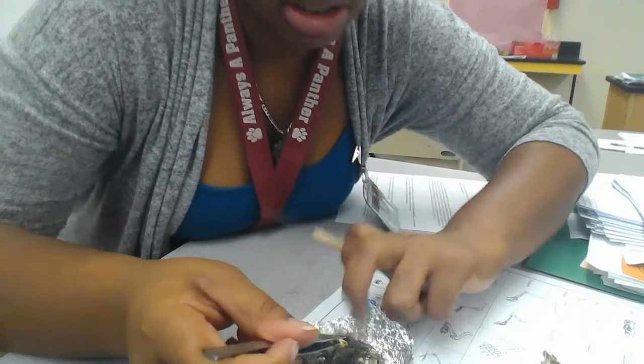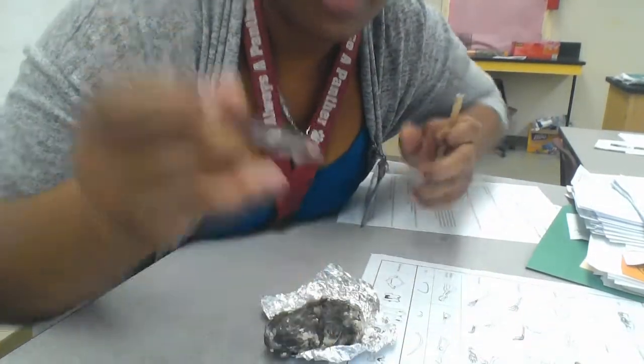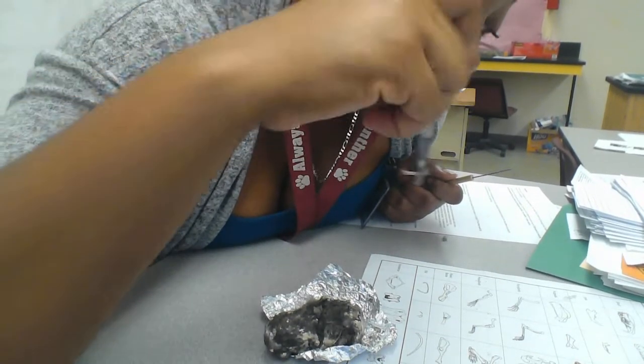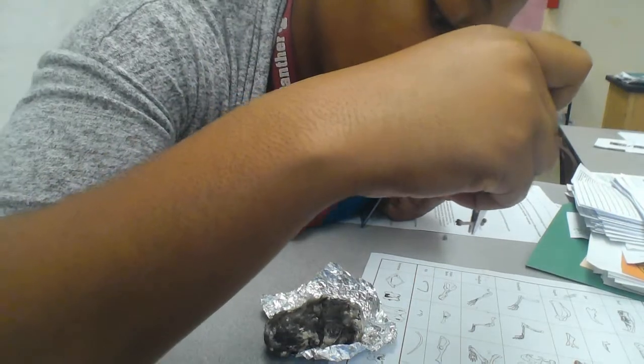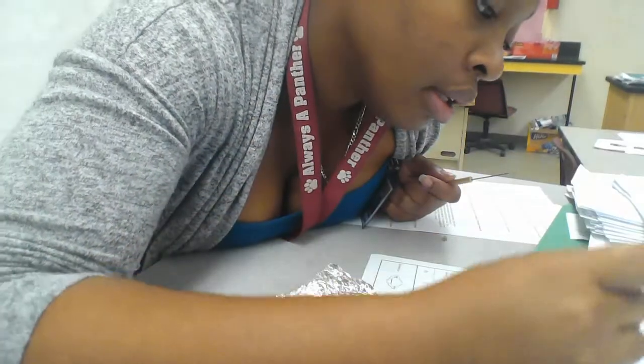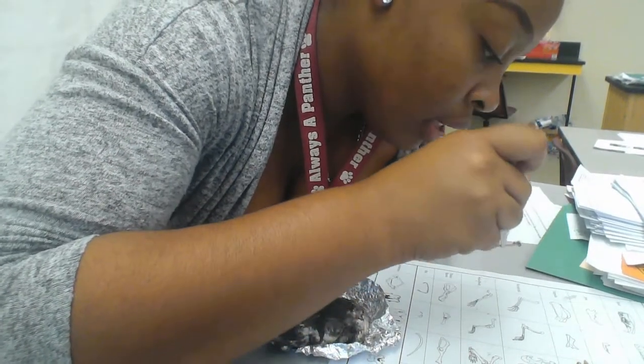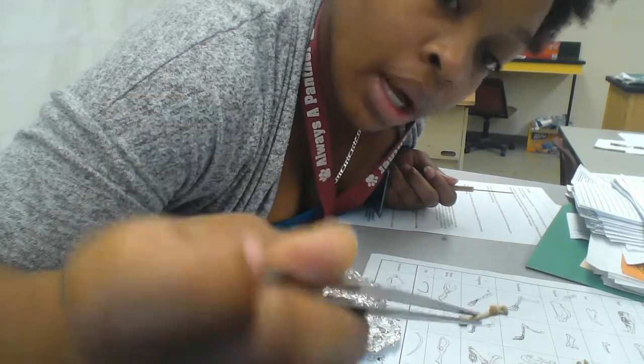You can't see me dissecting it, can you? All right, here's another bone that I found. It's actually shorter than the other one. But still, it looks like a mole bone. Maybe not. You know what it actually looks like? It looks like, in the rodent category for the forelimb, the actual upper arm, like this part of the arm, it looks like that. So I'm gonna put some money on that.